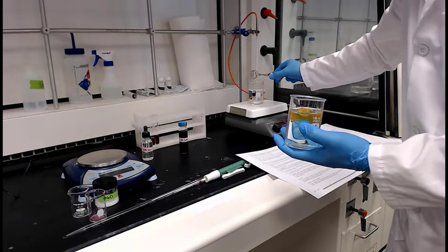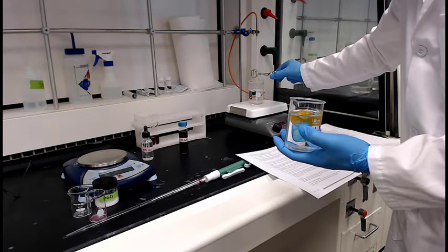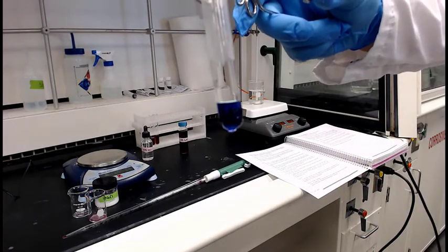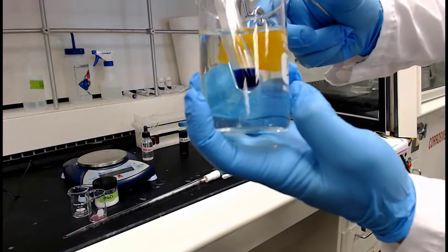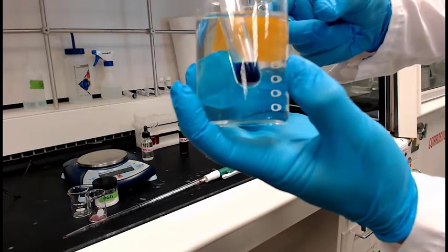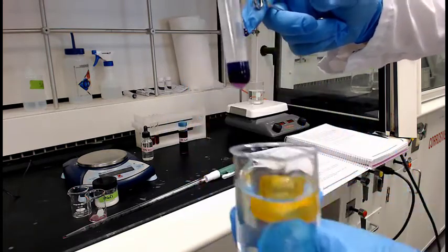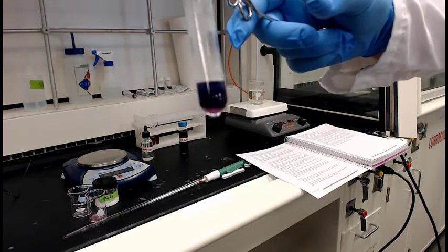So anyway, the point is that every time you change the temperature, it changes the equilibrium like we've talked about in class. That's dependent on whether the reaction is endothermic or exothermic, but this will give you a hint. Wow, look at that, goes blue. Now he's going back cold. Right where those tips touch those ice cubes really is where you'll see it, but if you leave it in there long enough, there you go, swirl, swirl, that's good. Be patient. Oh, Jonathan, you're not very patient. You can catch a little purple in the bottom.